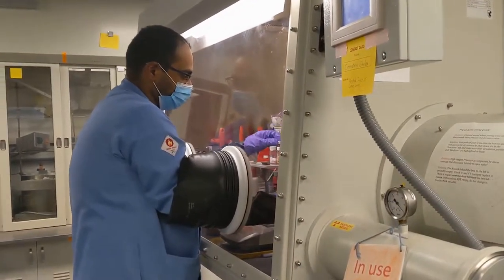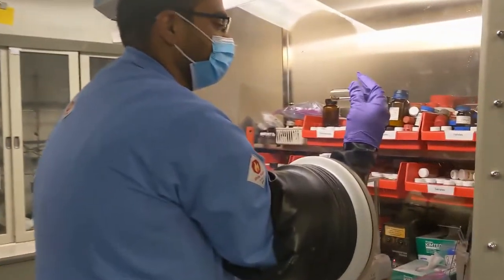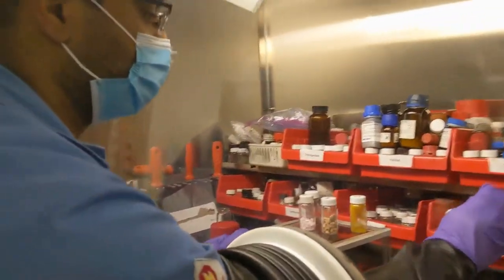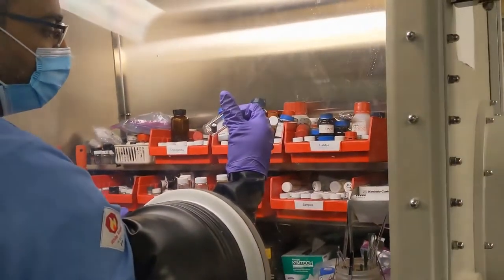Here we have our glove boxes where we store all of our air-sensitive reagents and materials. Solid-state chemistry involves a lot of air-sensitive reagents like rare earth metals, alkali metals, and alkaline earth metals, as well as any binaries or products that we might make that also have to be kept in a nitrogen atmosphere.